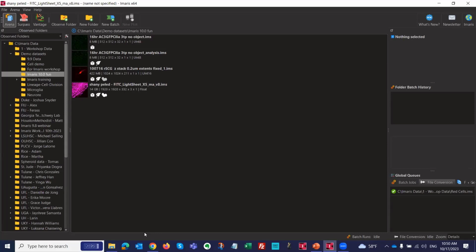I have a question on colocalization. With colocalization, can we get results for localization of another protein in the soma versus the dendrite? So basically having two different channels, like an IHC with two different stains. Yes, very good question.